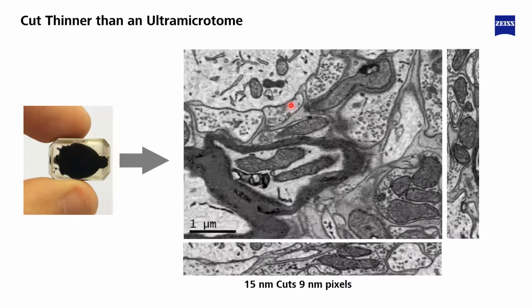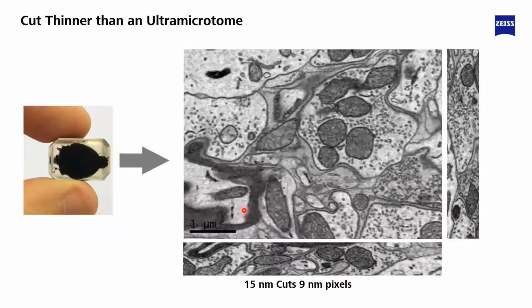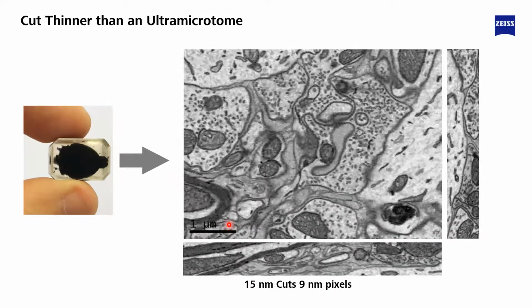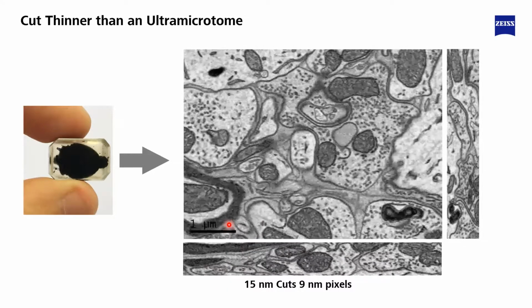And from time to time, if you look very closely, and you could slow it down, of course, but here, this is, for example, a synapse, and we can see a myelinated axon here with this big, thick and very dark myelin sheath around it, to eventually analyze, by the structure that we're seeing, which of those cells are making connections with each other.